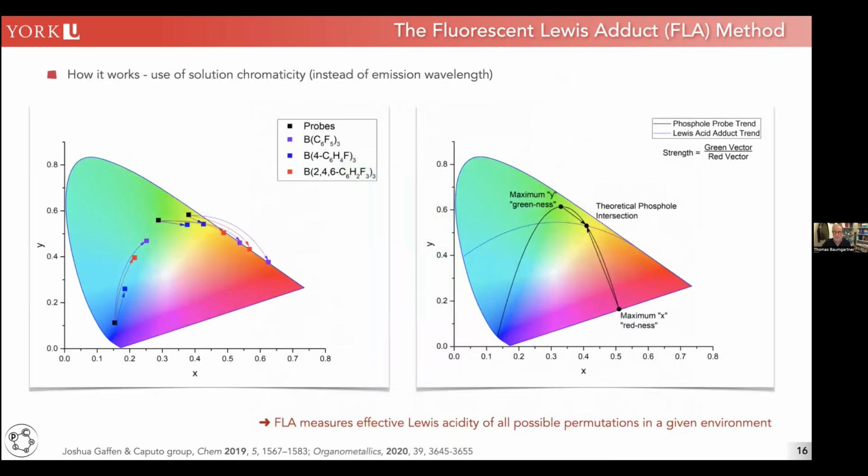And ultimately, what we then developed, and I'm going to jump in here, is where our three Lewis bases come into play. Ideally we do it with 4, but 3 is actually the minimum you need for a parabolic fit. So we have a blue Lewis base probe, the green one and the yellow one, the 3 that I showed you before. So the CIE coordinates would be here, here, and here. Again, you can see there's a parabolic function built in, and we were able to fit that with over 99% precision. So for the probes themselves, you can form a nice parabolic fit.